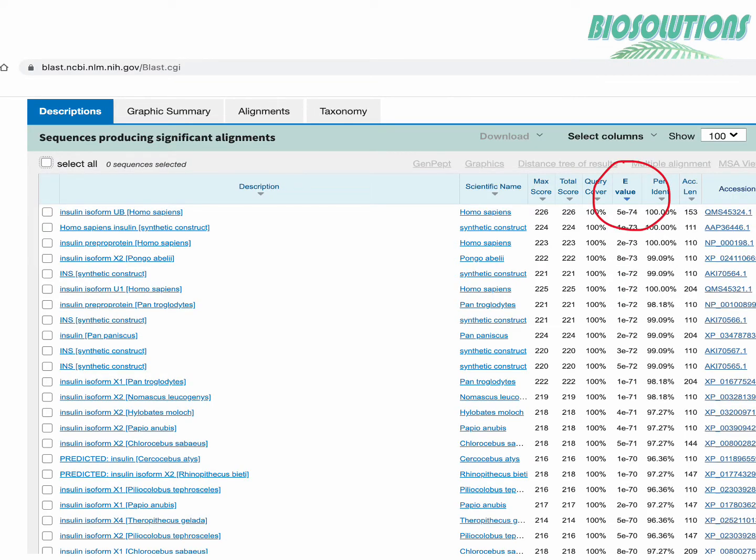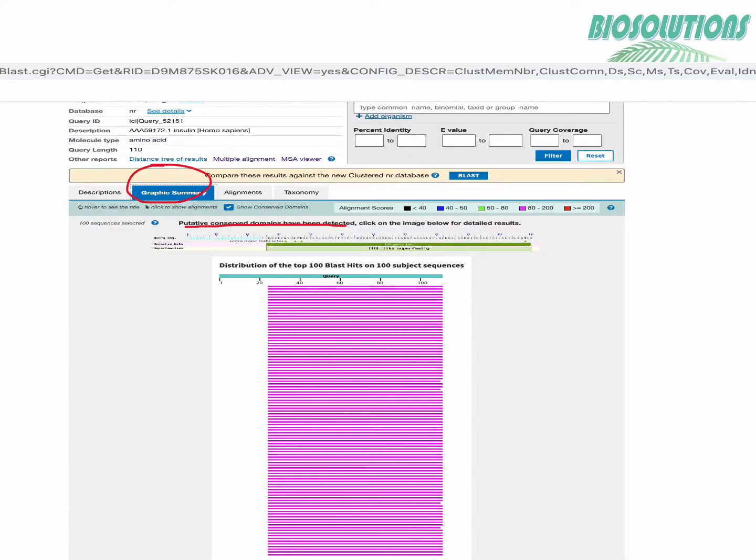Another important column is E value which simply tells us whether the alignment happened by chance. Lower the E value or the closer it is to zero the more significant the match is. Here the E value for us ranges from 10 raised to the power minus 74 till 10 raised to the power minus 43 which shows that all the alignment with human insulin query sequence presented here are significant and genuine.